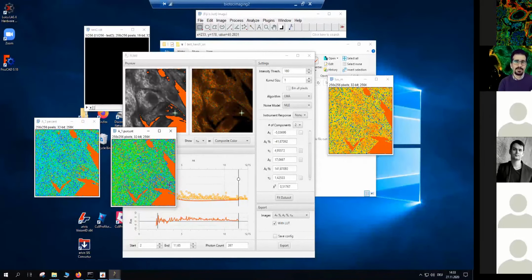So it's not only to find out the lifetime or mean lifetime or the fraction of the component, but how they are changing over time. And another thing is that on each compartment, if you are looking at the cells, for instance, the protein that we are looking at, or these changes that we see for special cofactors or coenzymes and other biomolecules inside the cell, how they are behaving, if they are in, for example, the nuclei, or in the cytosol, or if they have some kind of colocalization. We can also do colocalization between intensity and lifetime data.